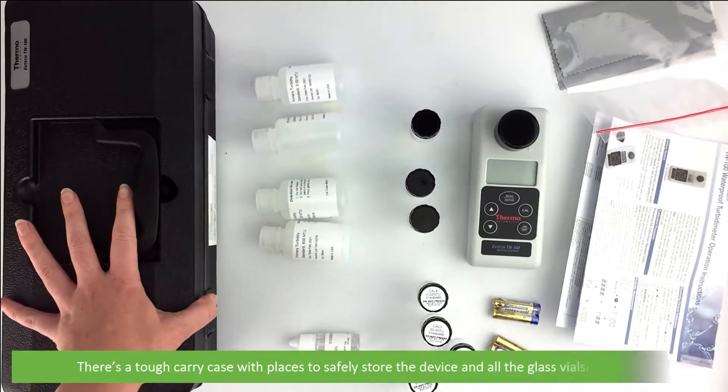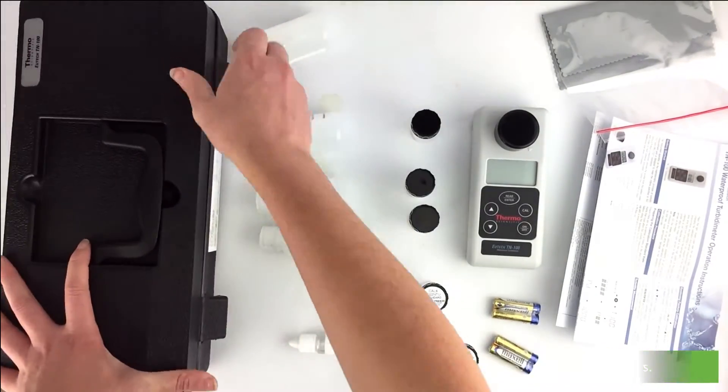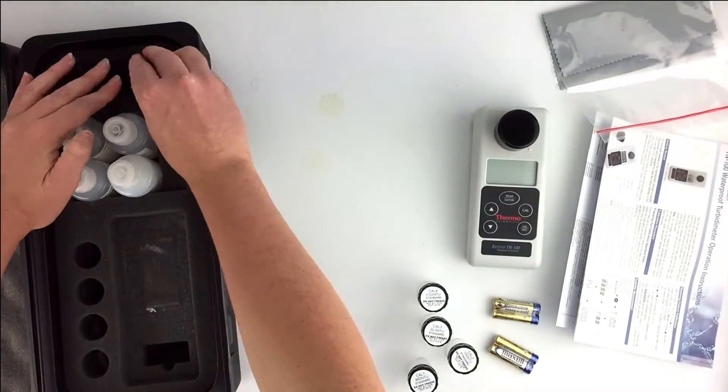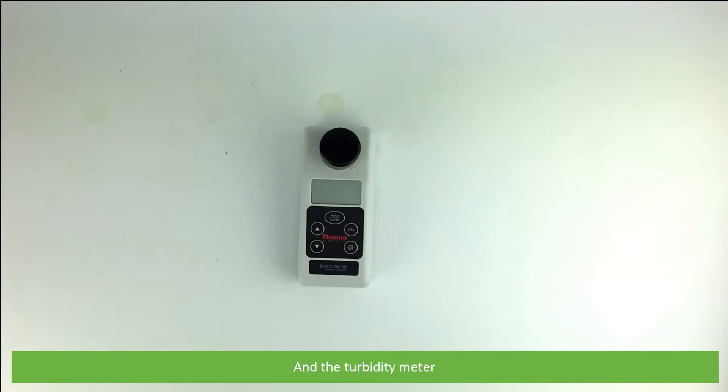There's a tough carry case with places to safely store the device and all the glass vials and solutions. And last of all, the turbidity meter itself.